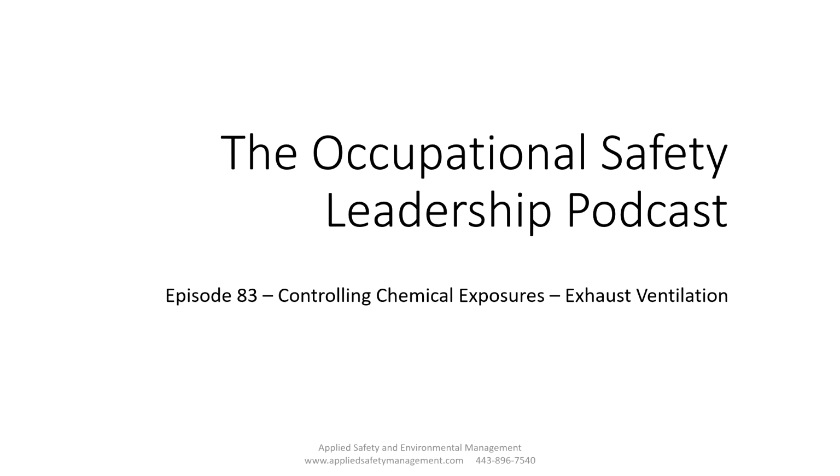So that is it for episode 83. Nice, short, and sweet. Please do not consider yourself to be an expert. We just very briefly covered how we're going to use exhaust to capture these particles. Size and weight play a tremendous part in this whole thing when we look at capturing exhaust. When we look at how we're going to use a fume hood, of course, we do a really good job of capturing everything. But that also doesn't mean that the human doesn't use sloppy handling with the material, with gloves and all the rest. Those will be for future episodes.